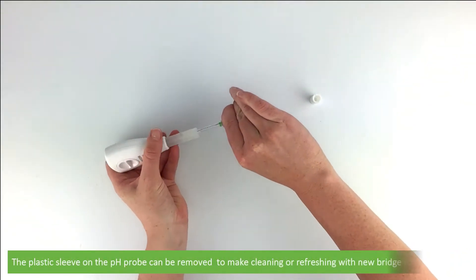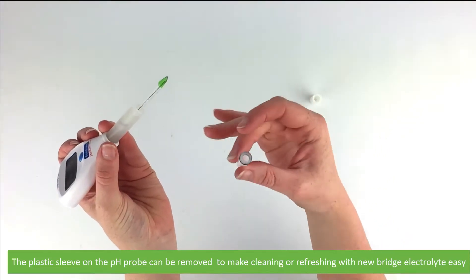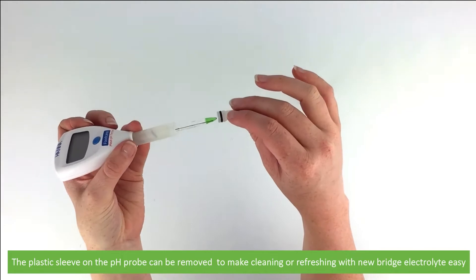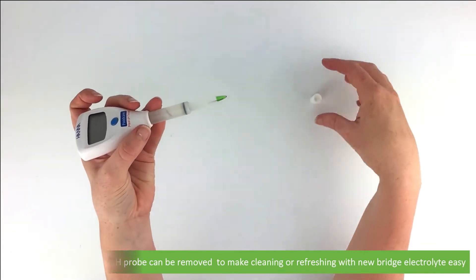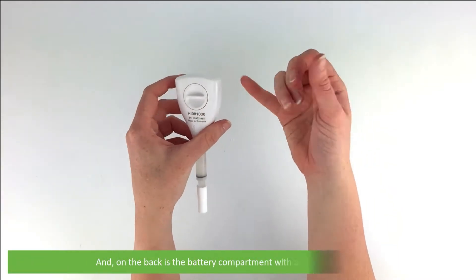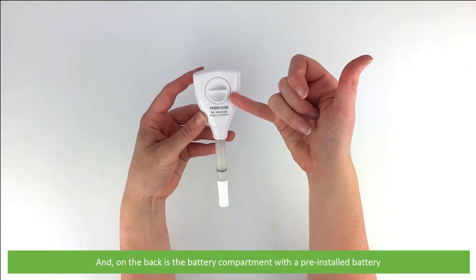The plastic sleeve on the pH probe can be removed to make cleaning or refreshing with new bridge electrolyte easy. And lastly on the back is a battery compartment that comes with a pre-installed battery.